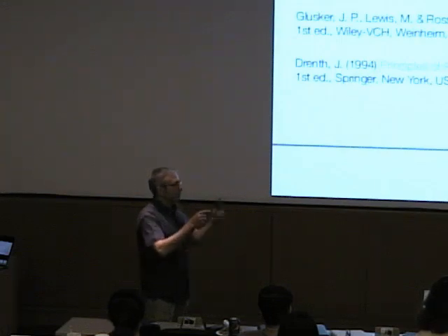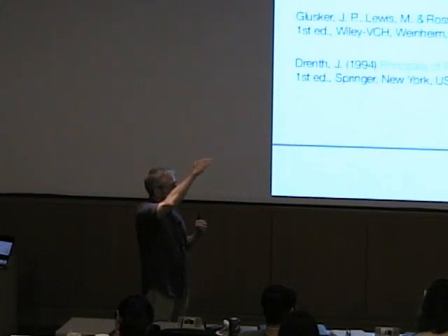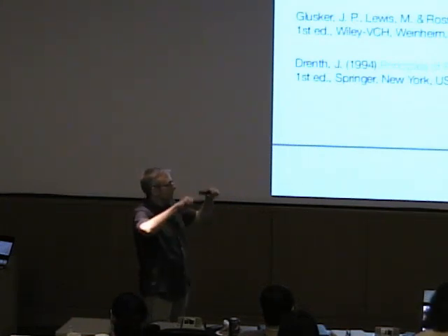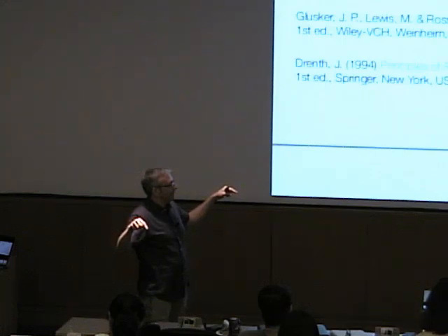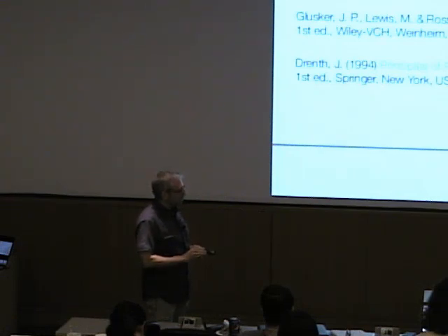So what you get is the typical thing of series termination artifacts, in the sense that you see the underlying repetitive structure of the wave that you are adding up. And if you have a big contrast, like a heavy scatterer in close proximity to something lighter, then of course you get periodic artifacts around that. And that's hard to avoid, but you can predict it and you can take it into account.